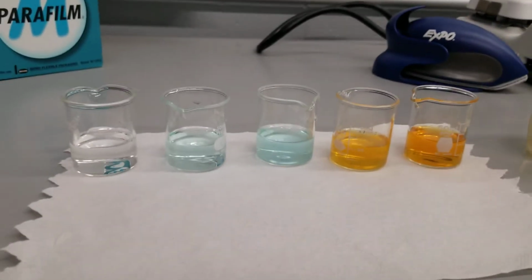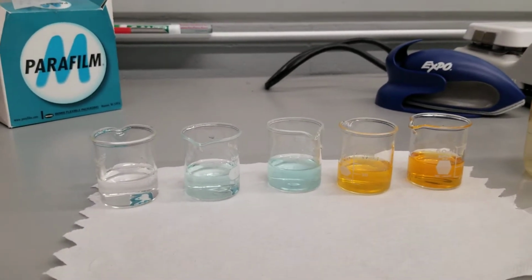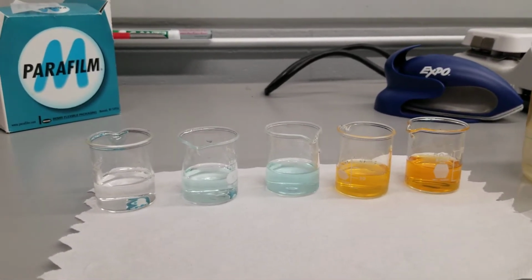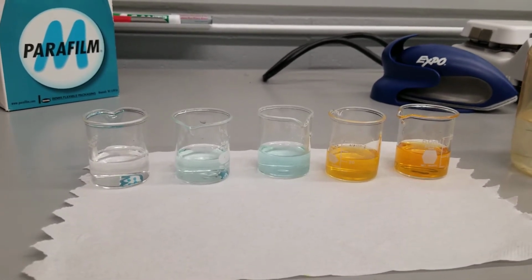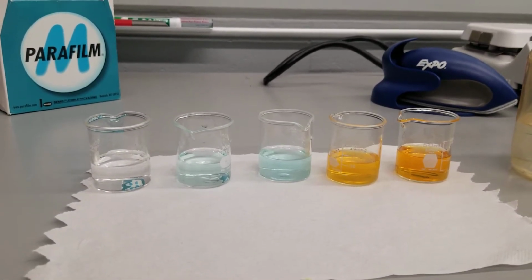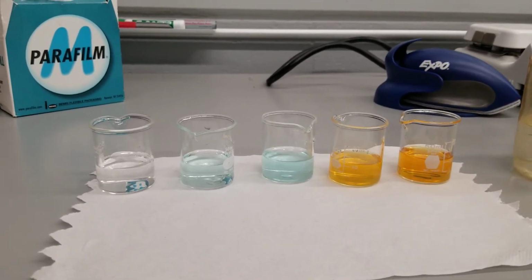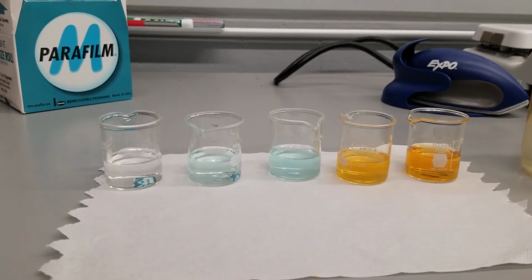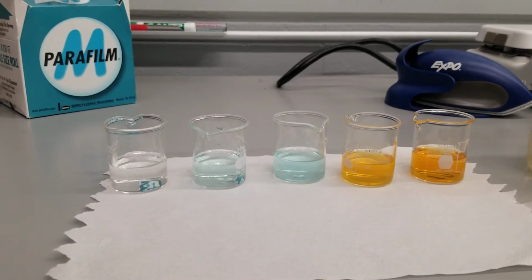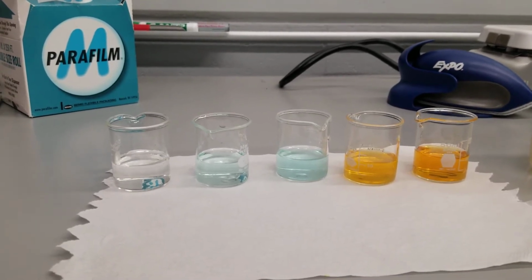And here is a test. It's a very simple and crude test used to detect the presence of heavy metals in water. Heavy metals could be things like copper, iron, nickel, chromium, lead, mercury, silver, and so on and so forth. This test is not quantitative in the sense that it doesn't tell you how much heavy metal you have there, but it does tell you that you have heavy metals in a certain sample of water.